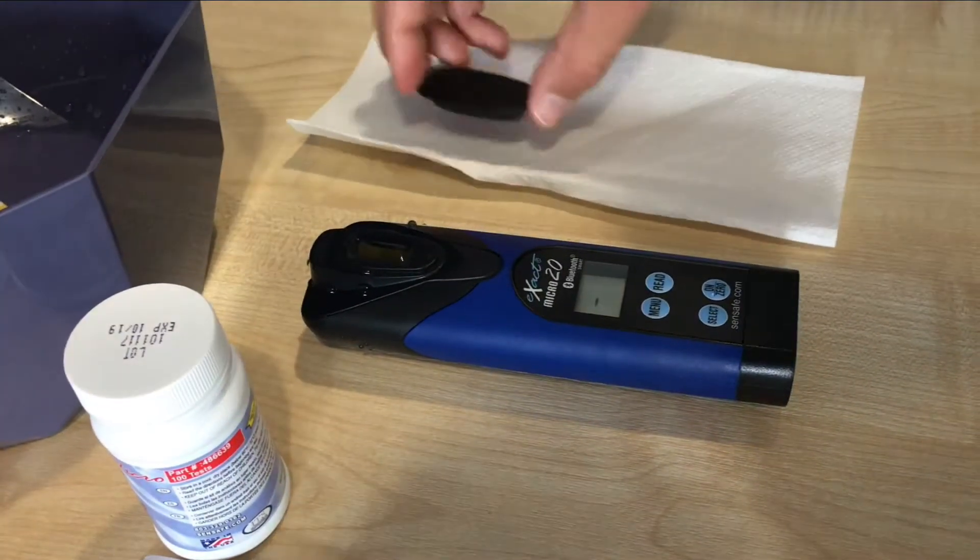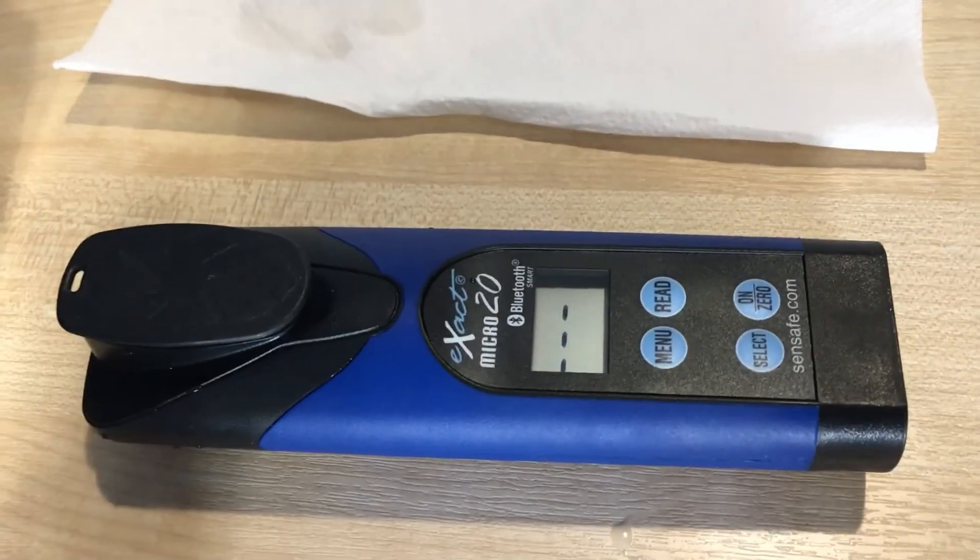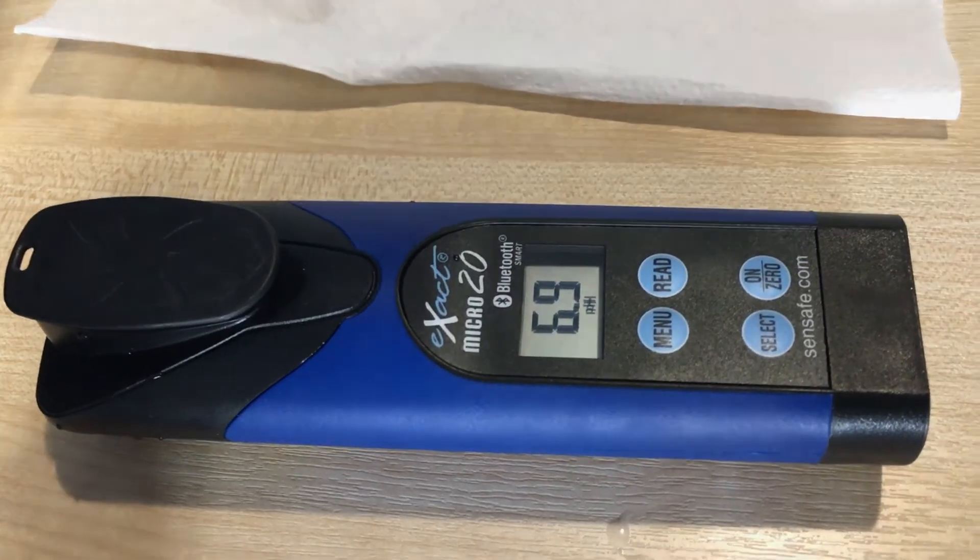We throw the strip out, put the cap over again, and wait for the result to appear on the screen. The result is 6.9.